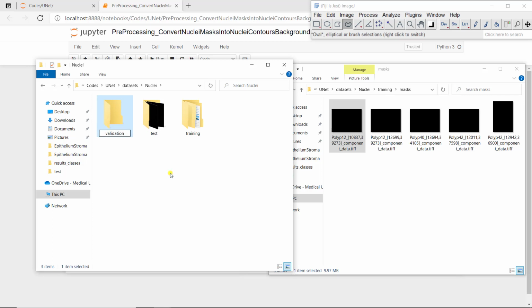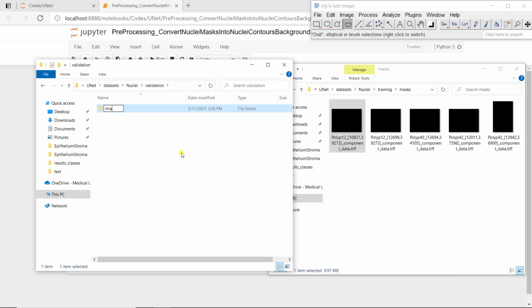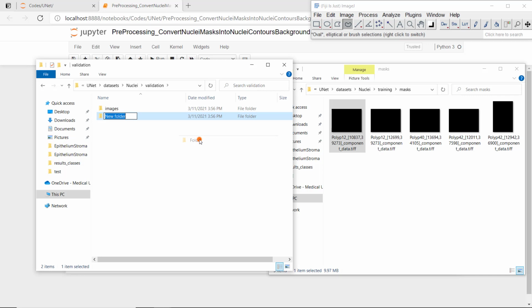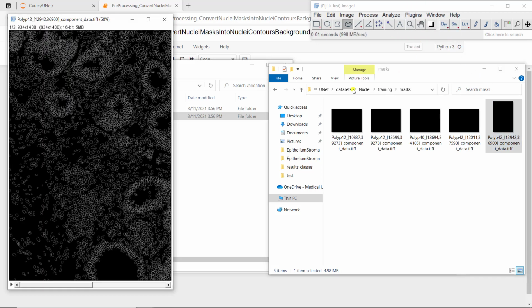All right. And in validation, I'm going to define 2 folders, one for images and one for mask. Given the codes we have, that's something that always has to be done. We need folders with images and mask, and the same name for images and mask in those folders, so the algorithm can pair the annotated images to the images. And I'm just going to put one image in the validation because we don't have that many images. So if you look at these images, the last one is actually smaller. It's the same height but half the width. So we're going to put this one in the validation.